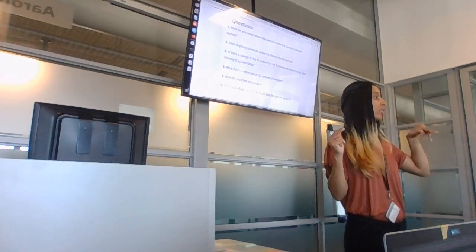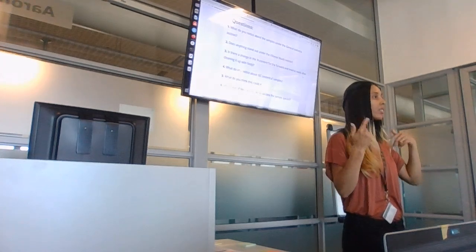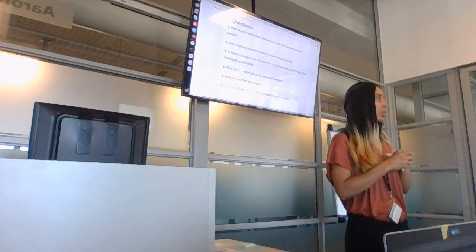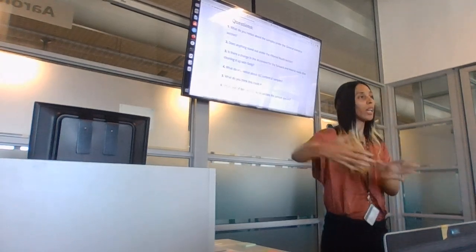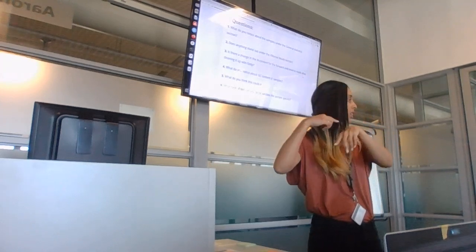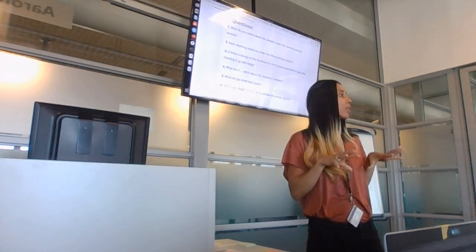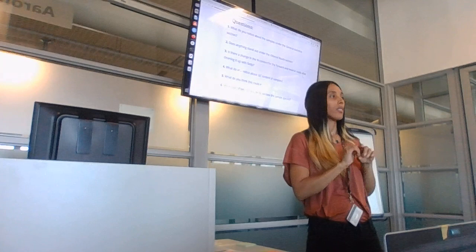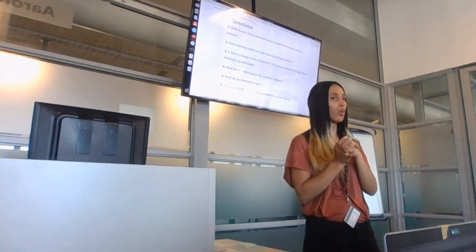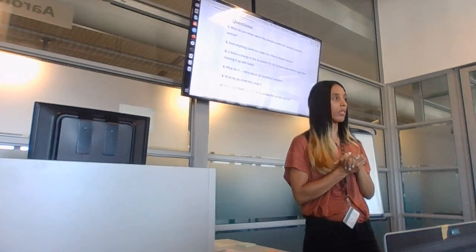So you can actually search for MultiQC and it will anticipate what your output files will be from that, so you can build your whole pipeline and run them as they go. It's almost like you're literally writing a script and saying input of this goes into that. You don't have to wait for results.